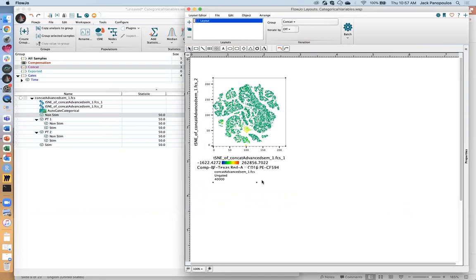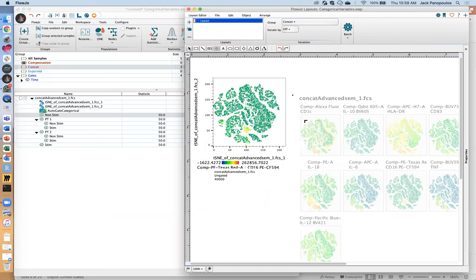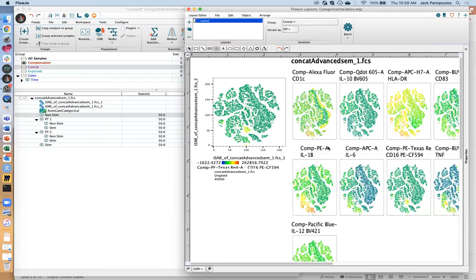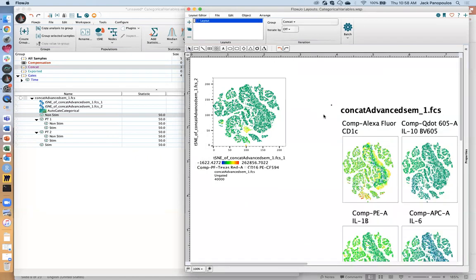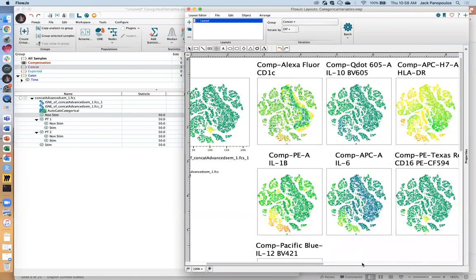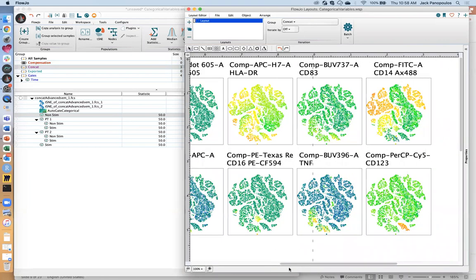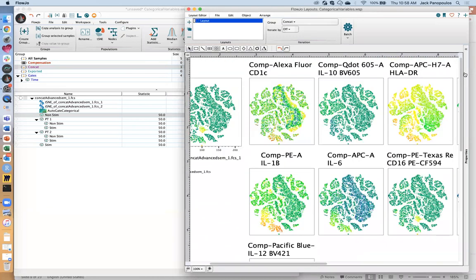It'll take a second or two, but what ends up happening here is it produces that figure that I was talking about at all the trade shows for every poster, right? Everybody has this, so you can orient yourself on the t-SNE map, so you can see where the different types of cells are, where the different expressors are, et cetera. Right? So it's a very nice, convenient way to visualize the data right off the bat. Now, this is great, but it has nothing to do with our categorical parameters comparisons, right? We really want to be able to compare experimental variables.